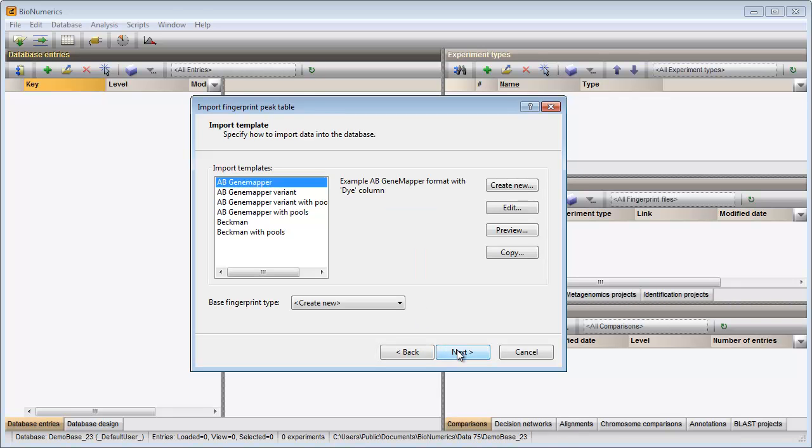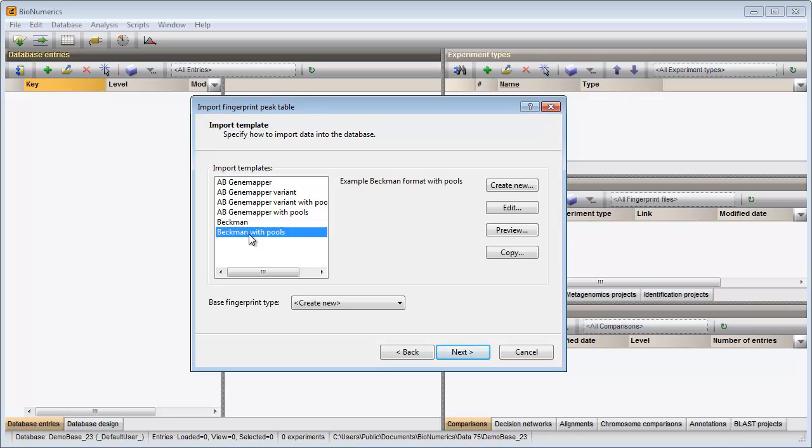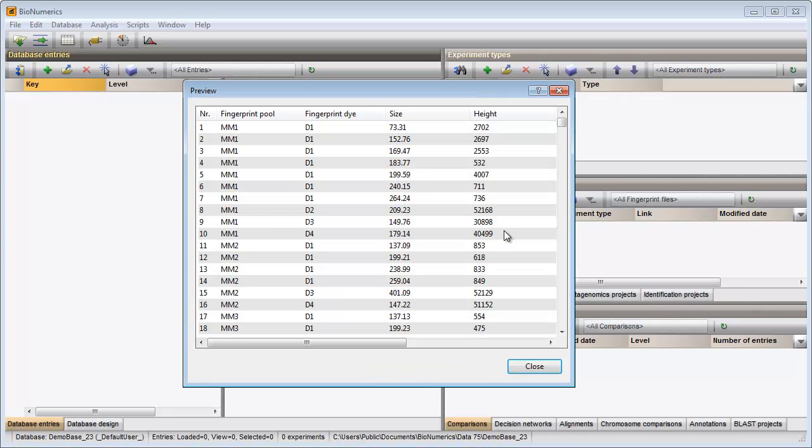The way the information should be imported in the database needs to be specified with an import template. In my example Beckman peak file, the dye, sample and pool information is provided. I can select the predefined template Beckman with pools. From the preview I can see that all information, including the pool and key information, is correctly parsed from the peak table file.